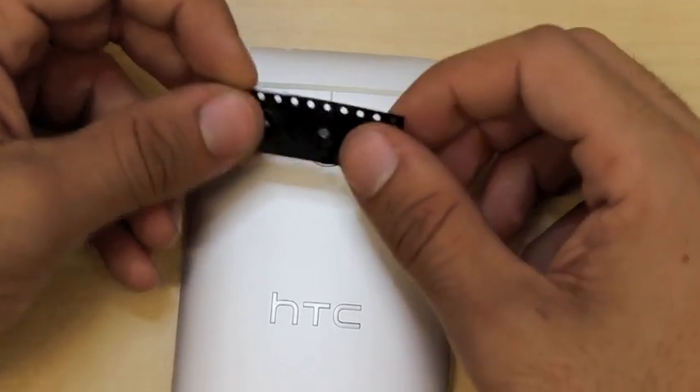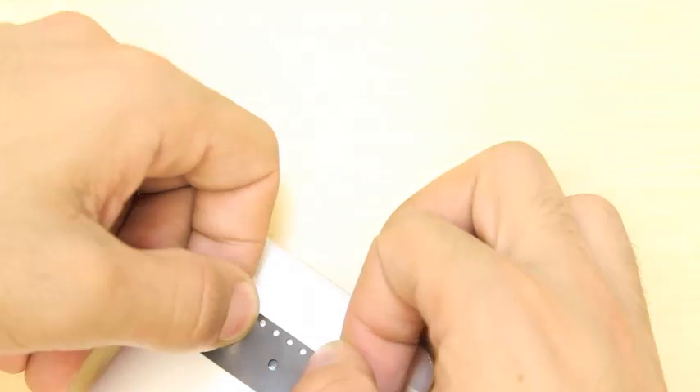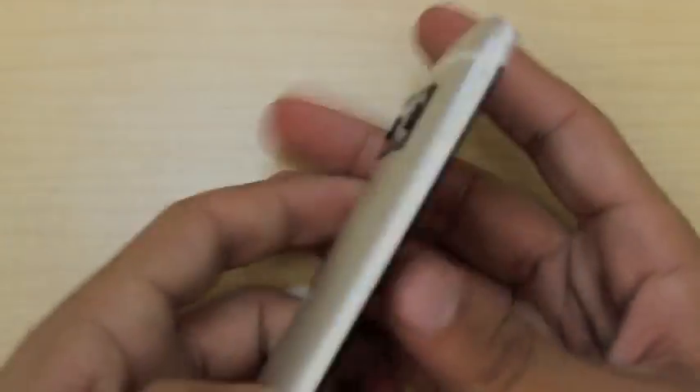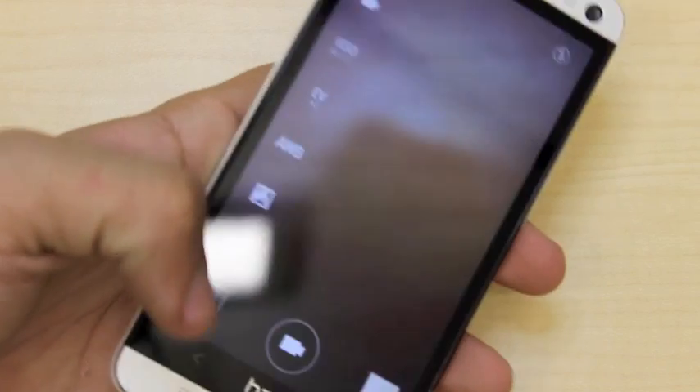Now you want to line it up so that the hole is perfectly centered with your camera. I'm going to peek at this to make sure I do a good job, and then firmly attach it. We can check to see if it's in the center by opening up our camera, and if we can see through the camera — which we can — then it means we did a good job and it isn't in the way.